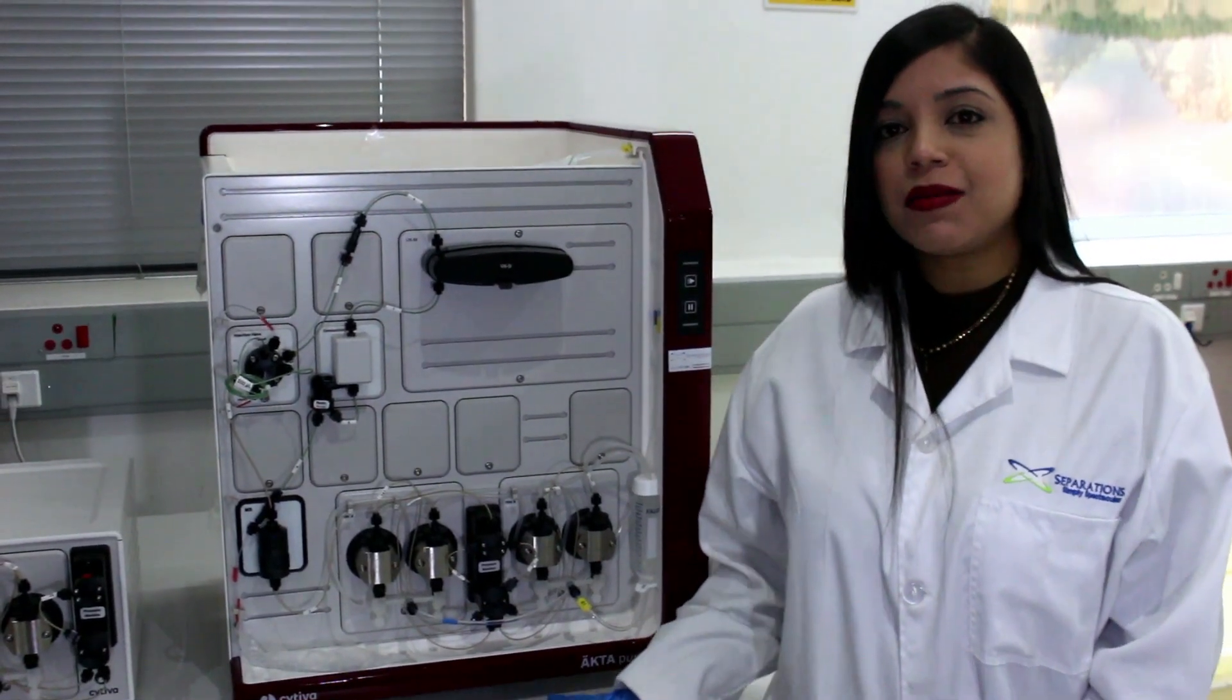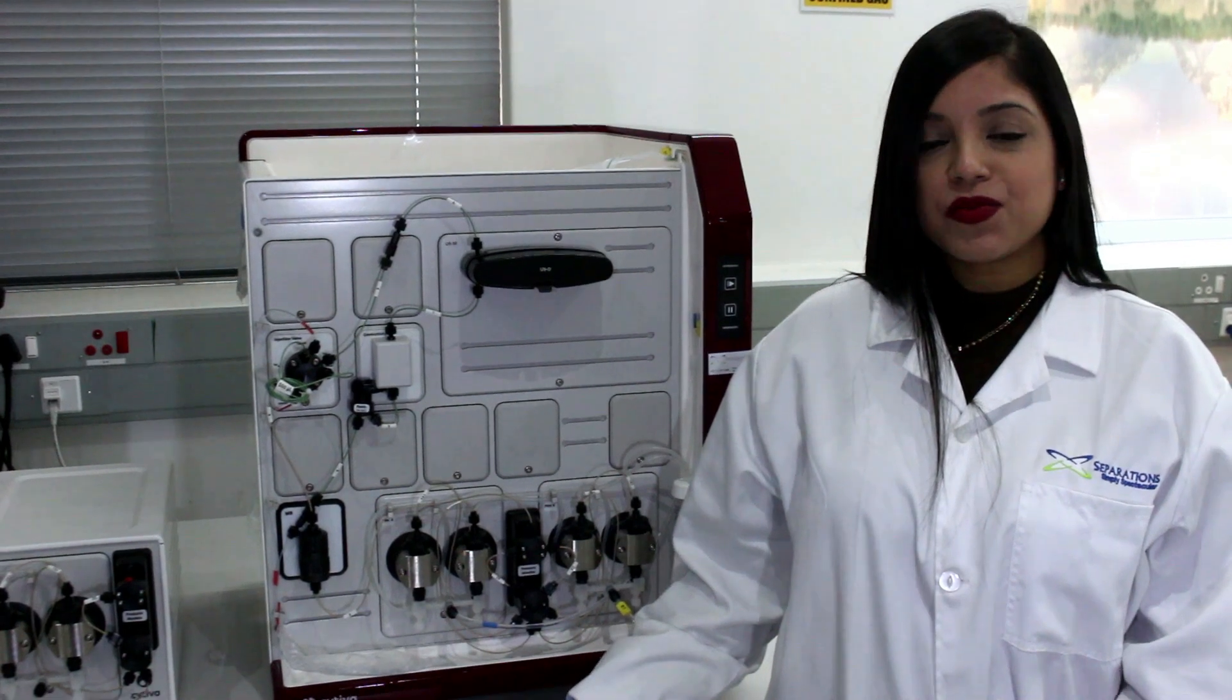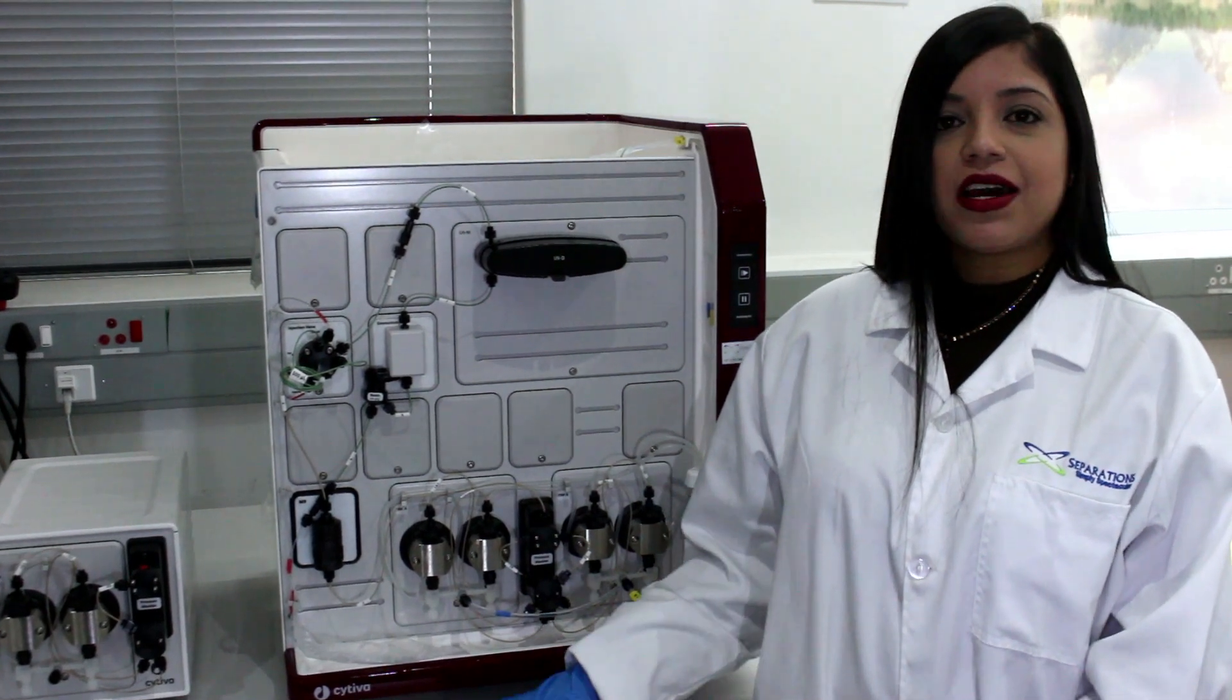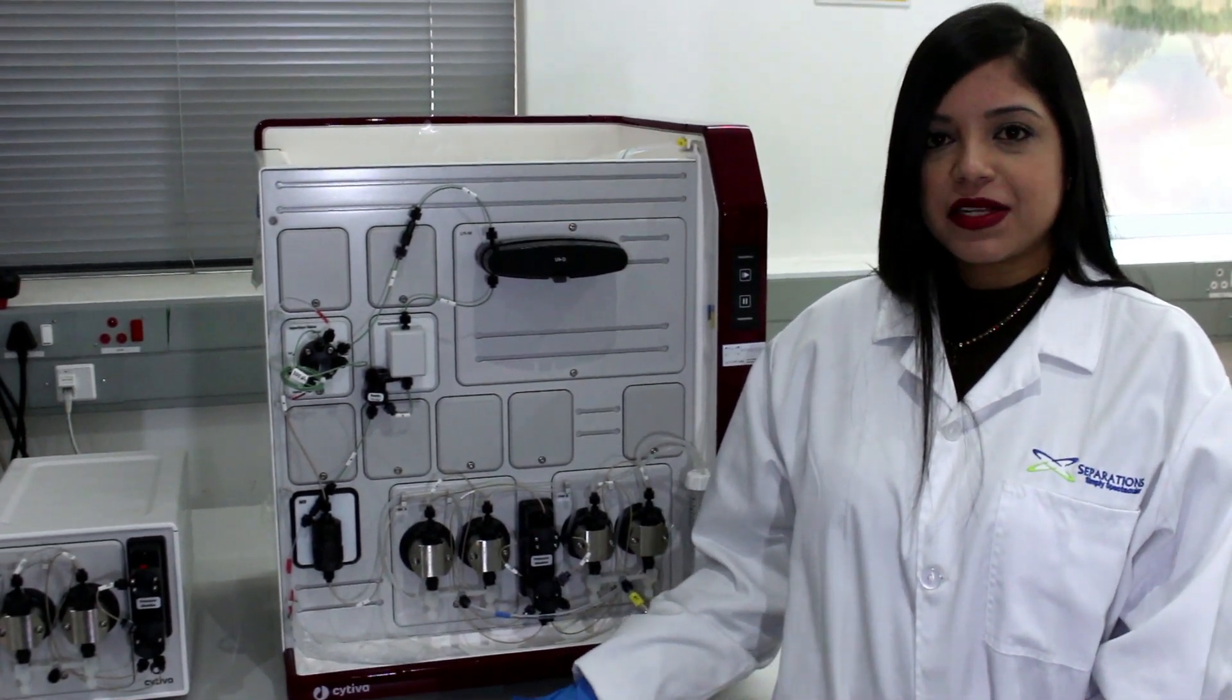The ActaPure system comes in two different versions: the ActaPure 25 and the ActaPure 150. The ActaPure 25 achieves a flow rate of up to 25 milliliters per minute, and the ActaPure 150 achieves a flow rate of up to 150 milliliters per minute.